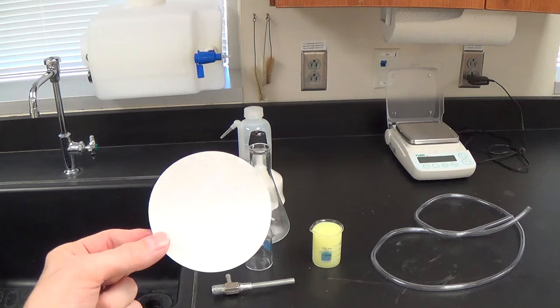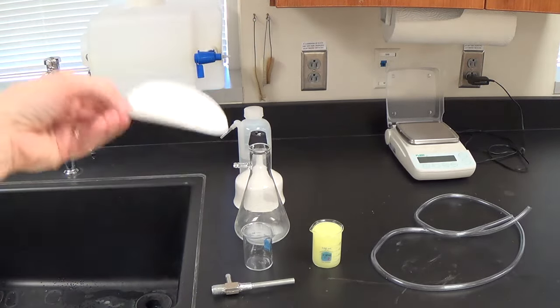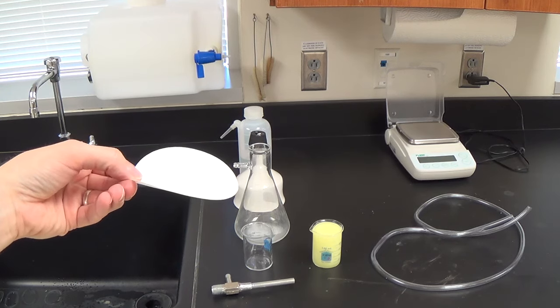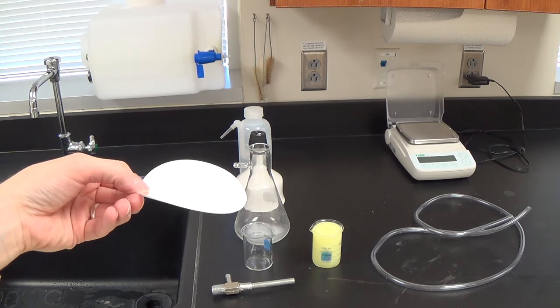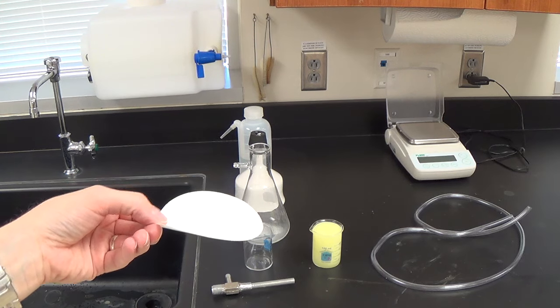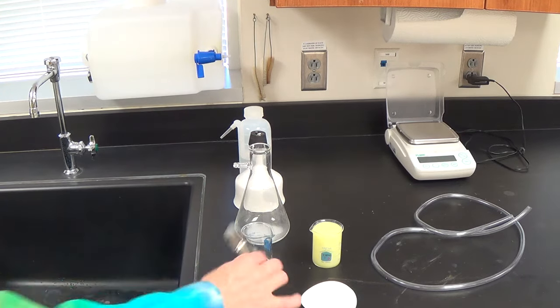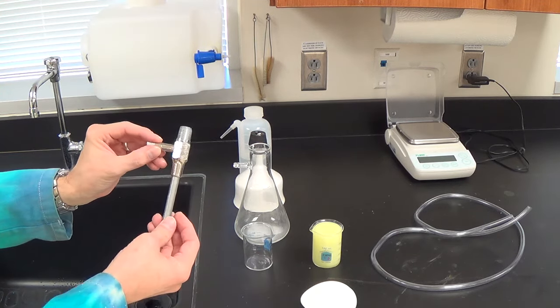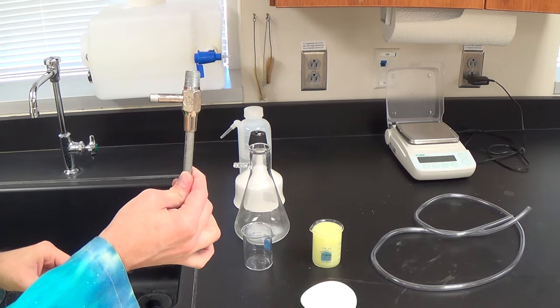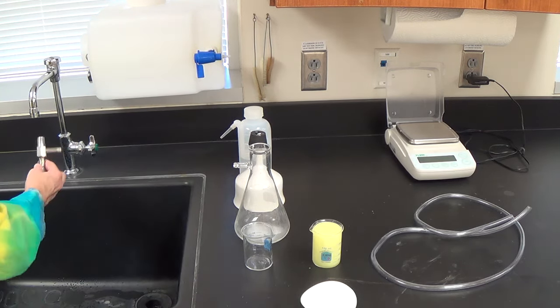on the filter paper. To speed up the process, because we could totally do it like we did in pre-AP, stick this in the funnel, take our time to pour through and filter it. We could do that, but to speed things up, we're going to use vacuum filtration. Doesn't that sound fun? All right, so for vacuum filtration, we're going to take an aspirator tip. I have one of these for each faucet in the room, so your groups are going to be limited to how many faucets I have.